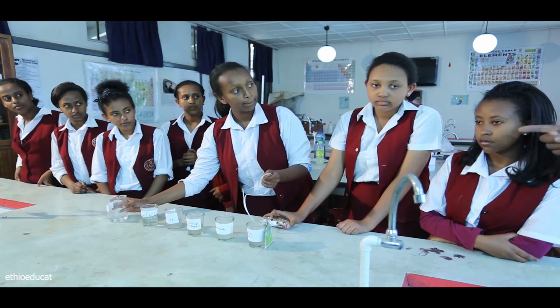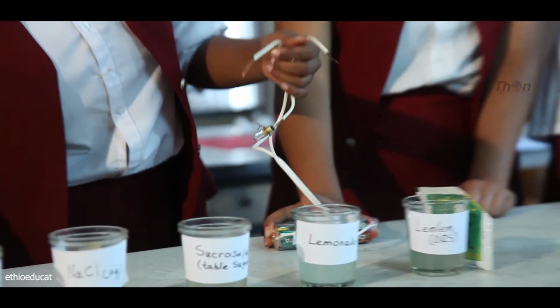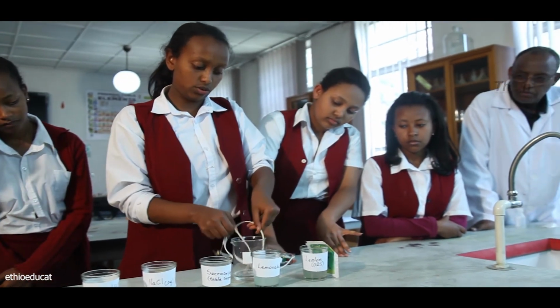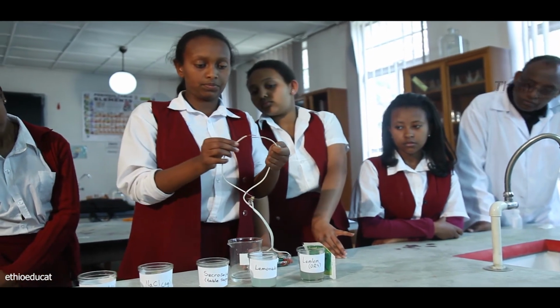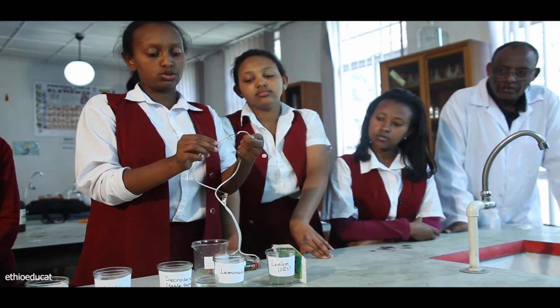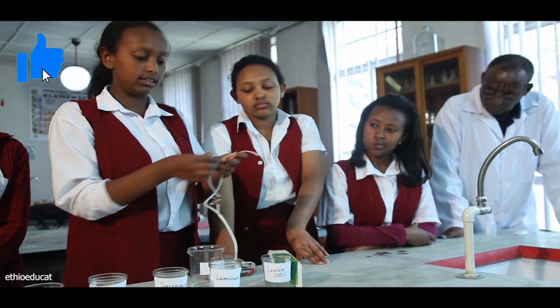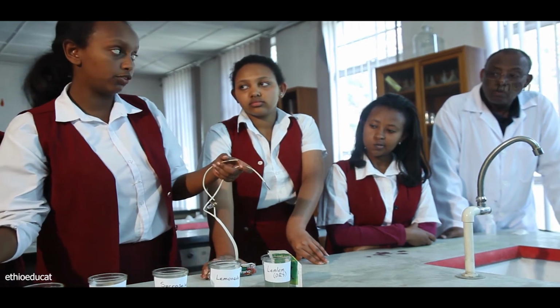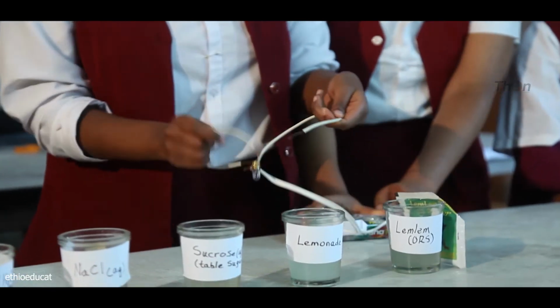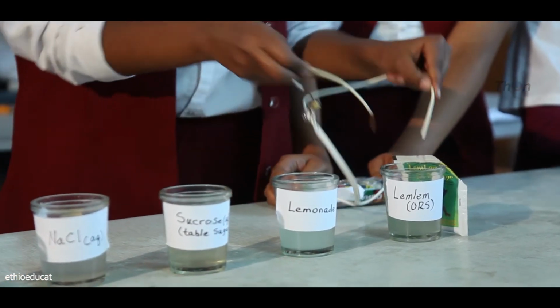Could you check if the bulb is working properly by connecting the wires themselves? Okay. Let's remove them first. Yes. When we connect it, the bulb works. Still functioning. So the fact that the bulb hasn't lit so far is from the nature of the compounds themselves. Okay, so for the last time, we'll check in our ORS.